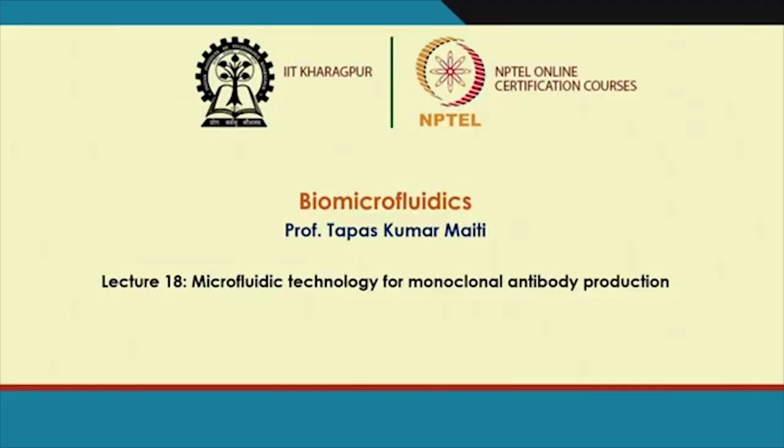And in my last lecture, meaning this lecture, I am going to discuss how hybridoma technology could be adopted in a microfluidic platform for monoclonal antibody production. And before going to monoclonal antibody, we have to know what an antibody is.